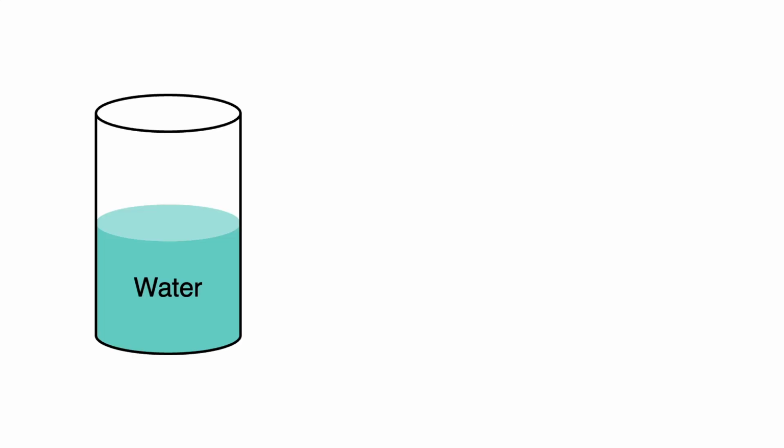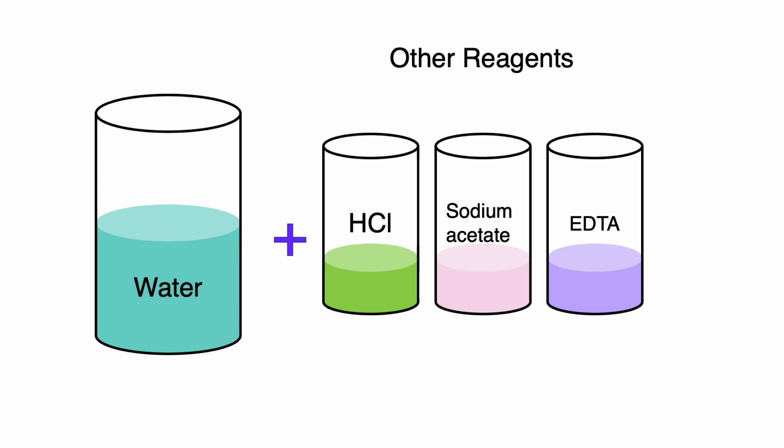When you do UV vis labs, your blank will include pure water because it's your solvent, plus all of the reagents that you would add to that sample before analysis. During the experiment, you'll put your blank into the instrument for analysis first. The absorbance will be measured and set as a baseline for any subsequent analyses. In other words, the absorbance of anything other than your analyte will be quantified and subtracted out.